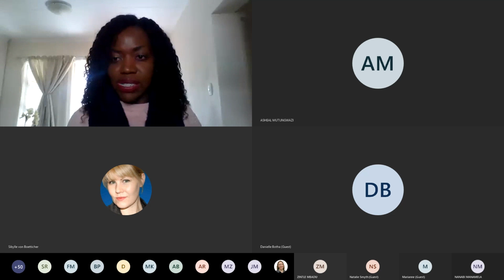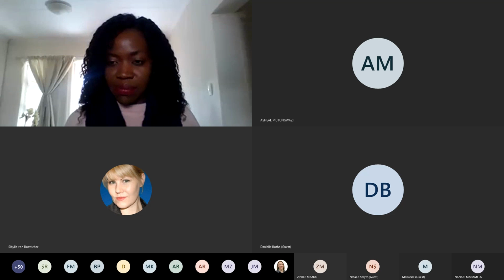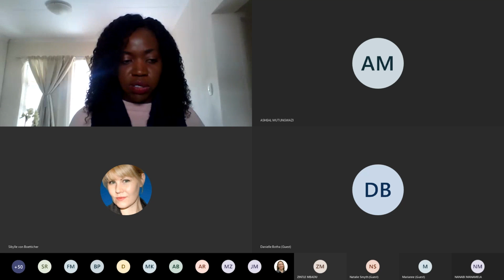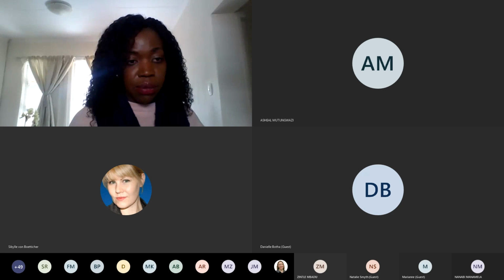Any other questions? So I think by the end of today, you would receive a link for registering for the next session. Next week, we're looking at the iSeq in the first session and then the MiniSeq in the next session.